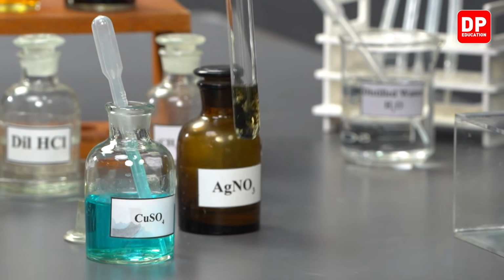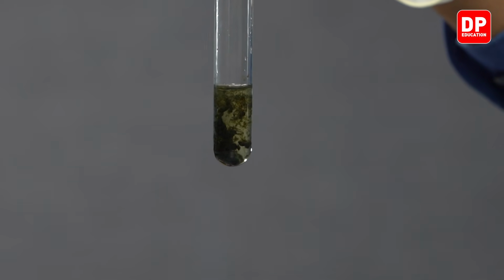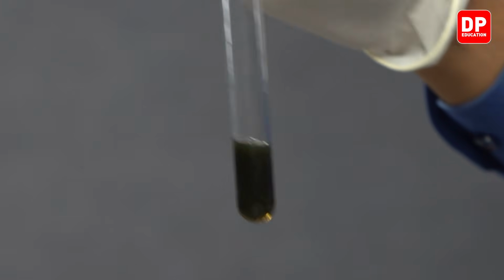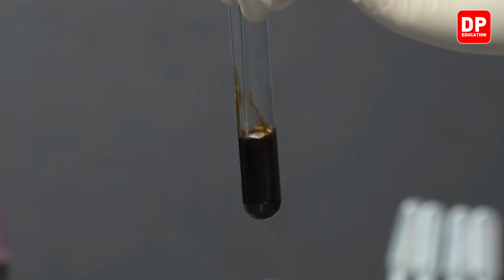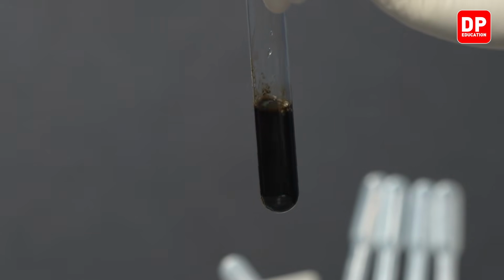Did you observe the formation of a black color precipitate? If I shake it, you can see that it gets dispersed throughout the medium. I can add a little bit more copper sulfate to give you a very clear color change.